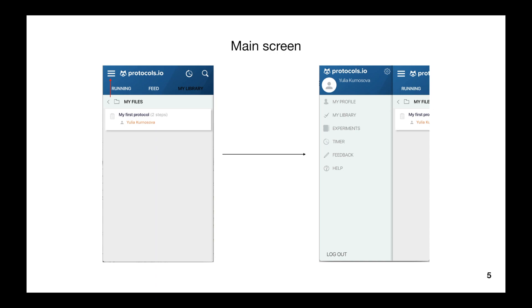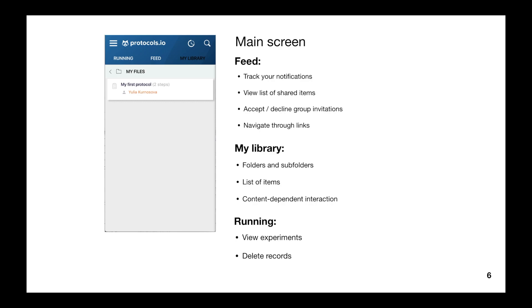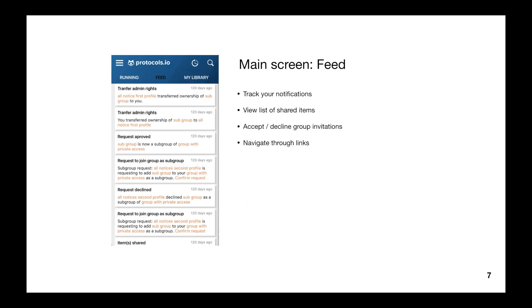A few words about the structure of the main screen. As you can see, it includes three tabs: Running, which includes all your experiments, and My Library, also called the file manager. The tab in the middle, called Feed, opens a list of your notifications. You can track them, view a list of shared items, accept or decline group invitations, and navigate through links by tapping highlighted words. You can view protocols, groups, and user profiles directly through the app.